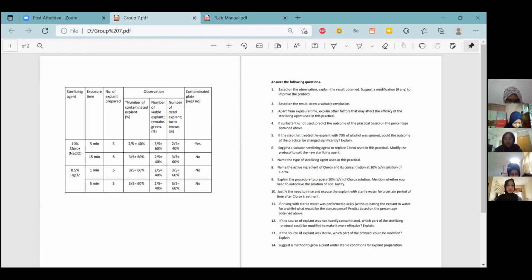For the Clorox, first we need to add 9 parts of water to 1 part of laboratory bleach. Bleach solution is very corrosive to stainless steel, so it is required to use a plastic container to mix and store the bleach solution for hours only.